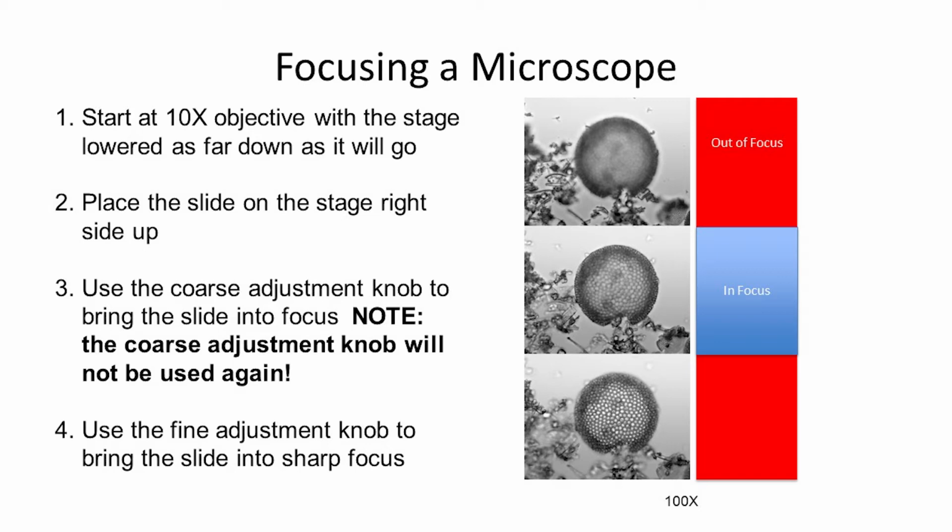This is a cyanobacterium, so it's very, very large. Right now, we are focused above this bacterium, so you can see that we're really far above the height. And as we move down, we can see that a good chunk of the bacteria is still in focus, but some parts are still a little hazy. It's because we're moving into the plane of focus that optimally gives us the best picture. And as we continue to focus through it, some other parts now become even more fuzzy, and we're looking at the bottom plane of this. So there's a nice Goldilocks range you want to aim for when you're looking through a microscope and trying to focus.